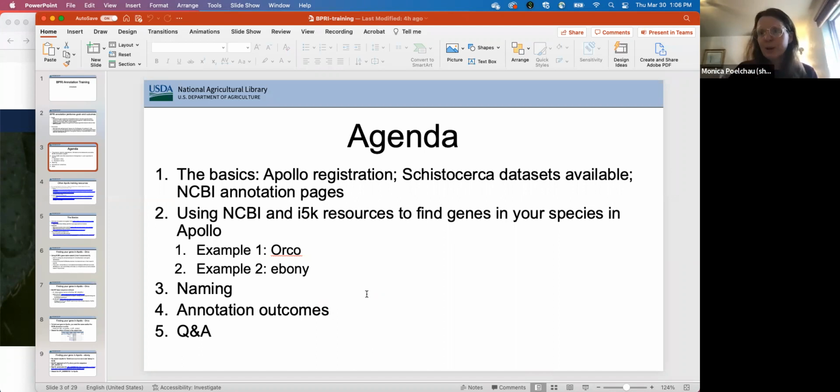And I want to talk a bit about those annotation outcomes that were defined by your goals for this project too. And then, Q&A.